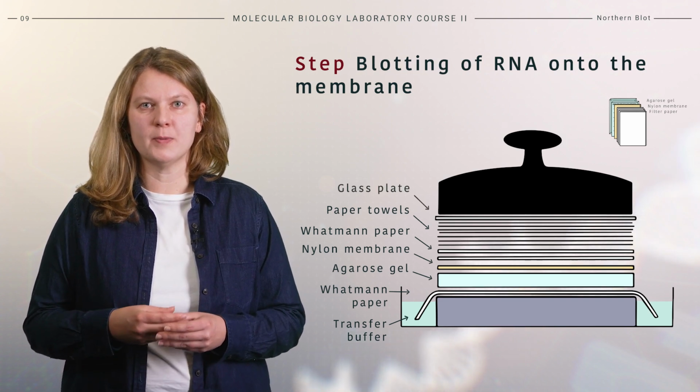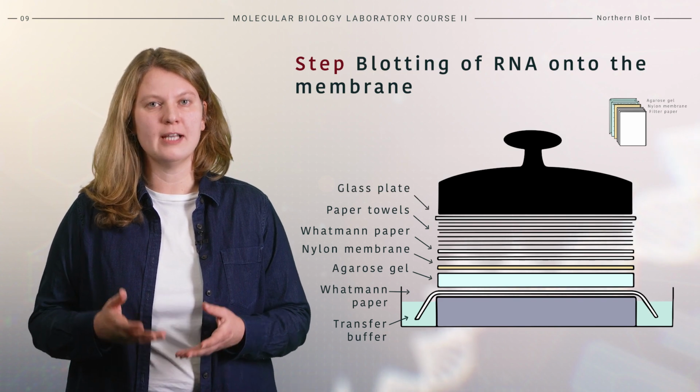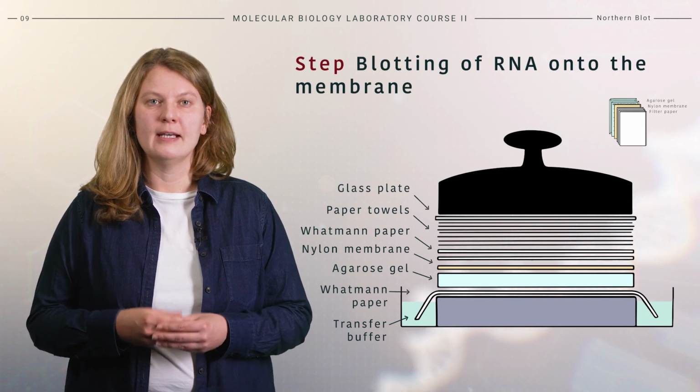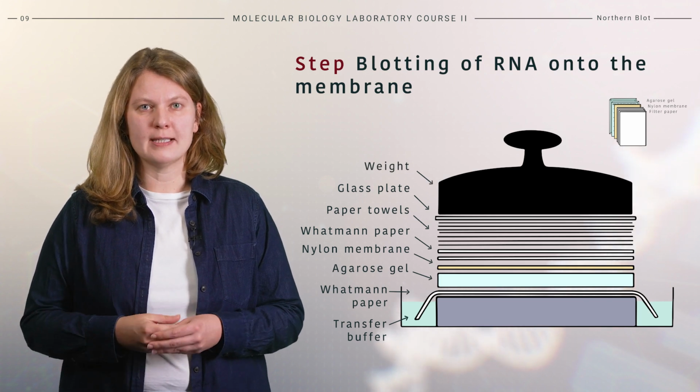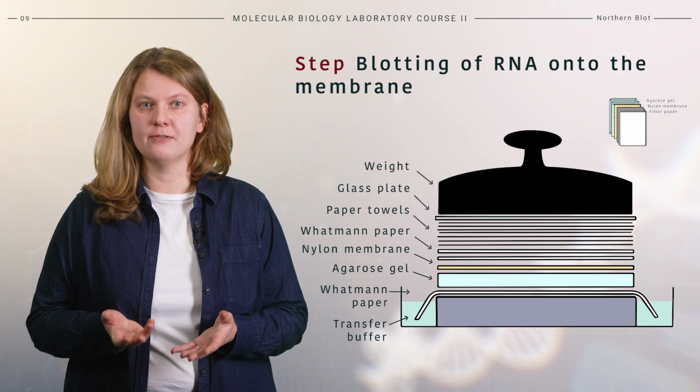A glass plate is placed on top of the blot to hold everything in place. It is also recommended to put some weight on the top. The blot is left overnight to obtain an effective transfer.